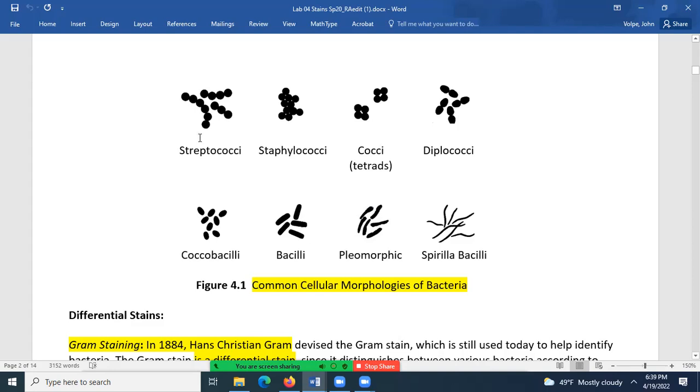For bacilli, they have to be lengthwise to be called streptobacilli, and you can think of that as a chain of hot dogs linked together on the long side of the hot dog. You can have the cocci hooked together in a cluster, and the cluster sort of looks like a cluster of grapes, and that is called staphylococci. That's actually what staphylococci translates into, cocci in the shape of a cluster of grapes. That's what that word means.